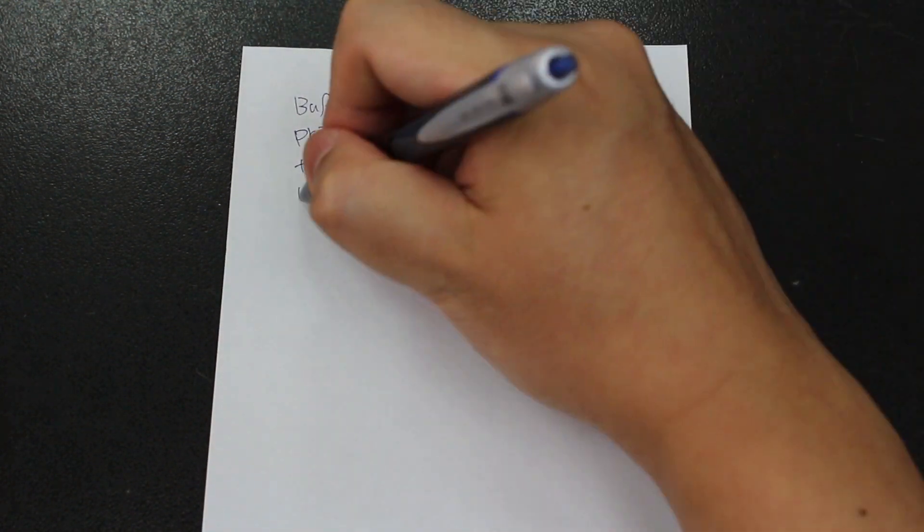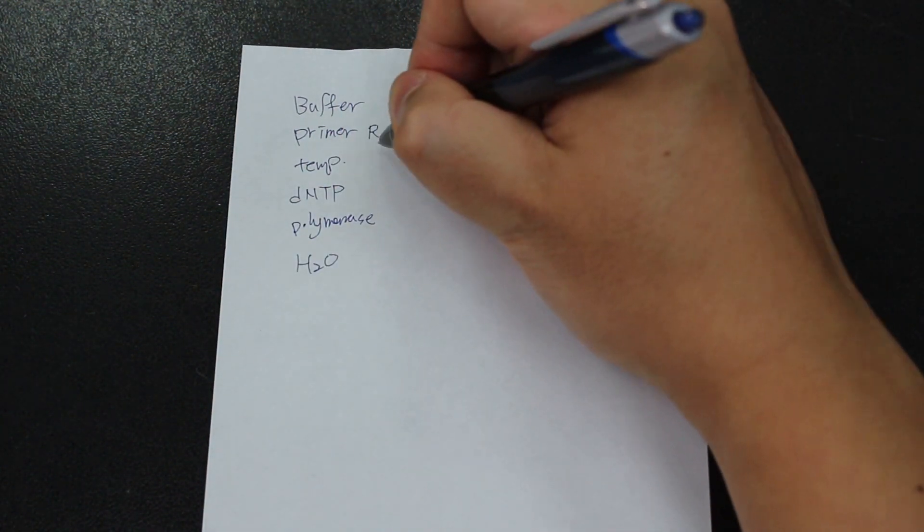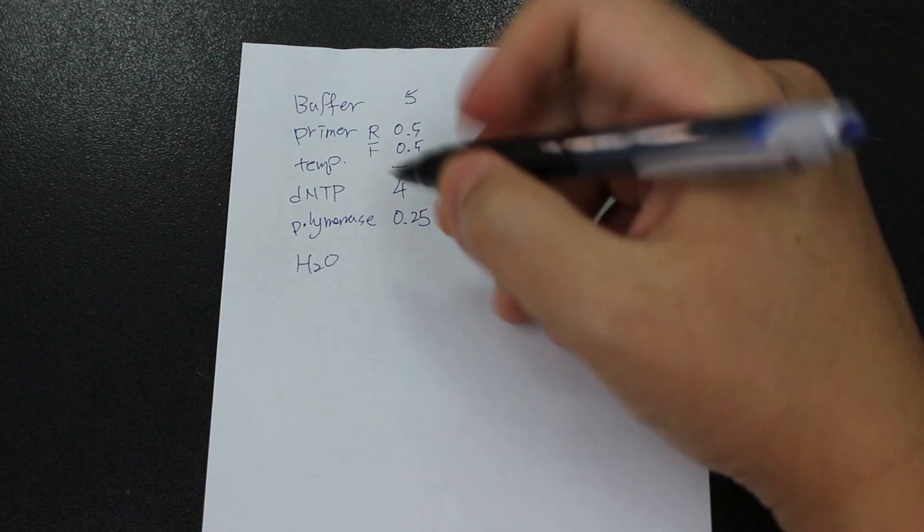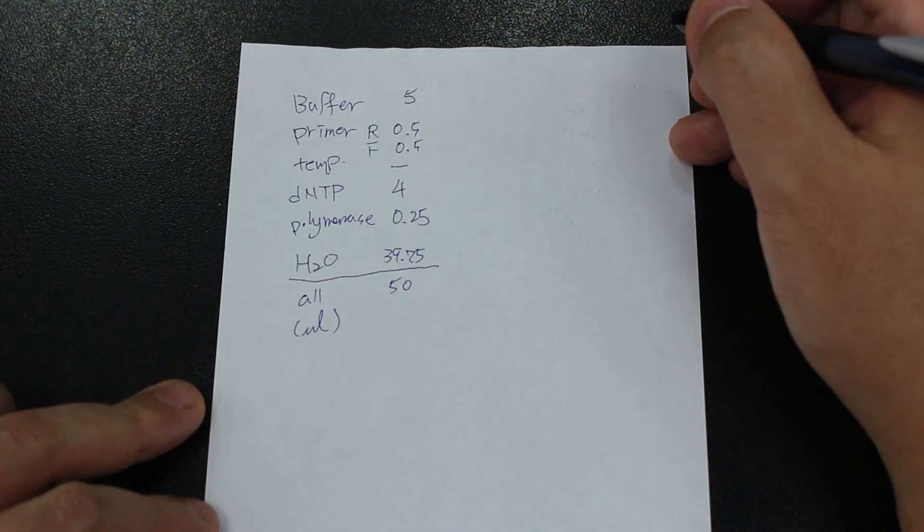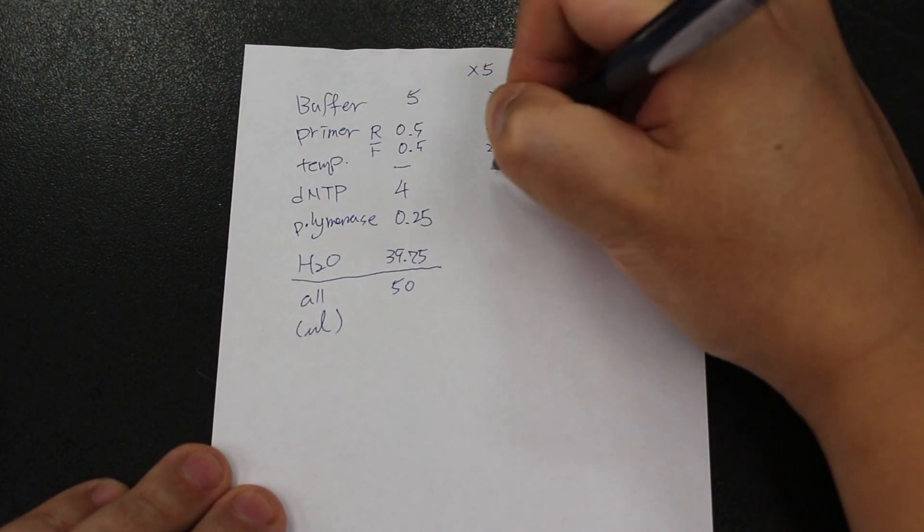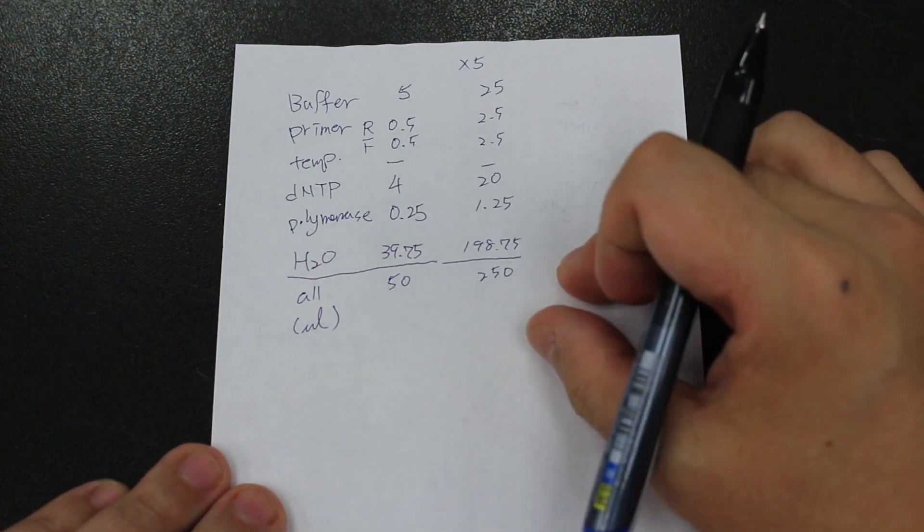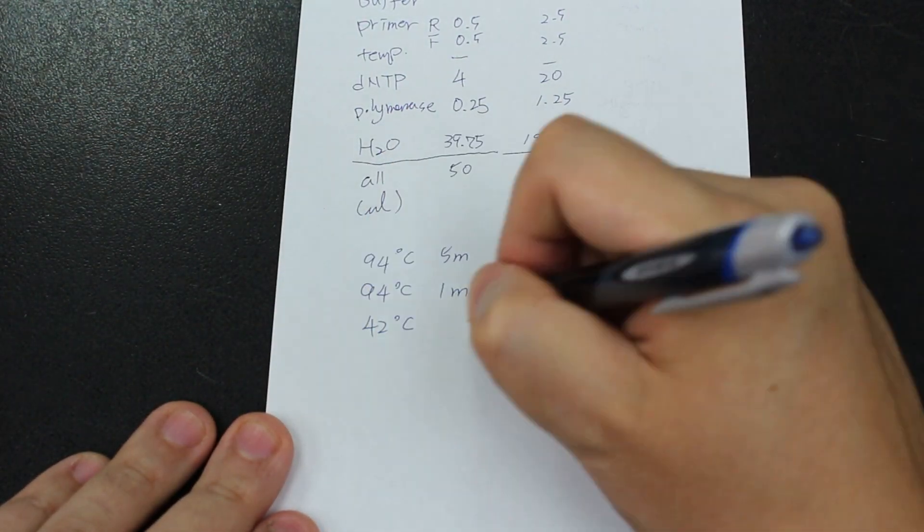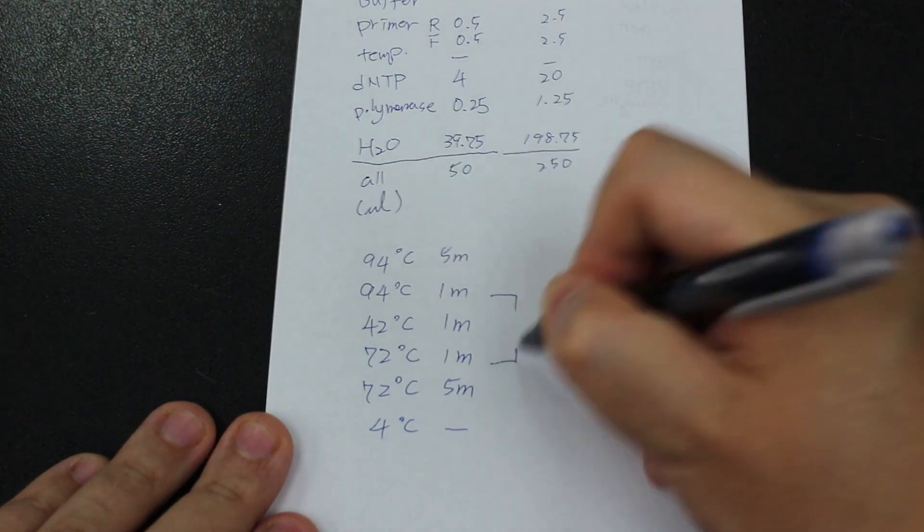Before start, I suggest writing down all the reagent you will use as well as the PCR protocol. And since I have four samples, I will prepare five times the amount of reagent to compensate for the pipetting error.